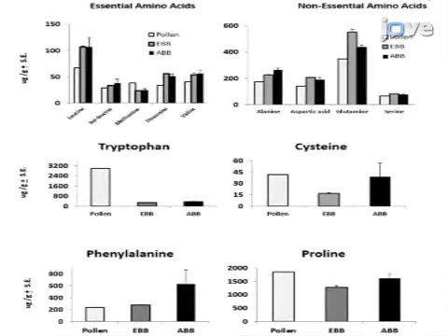The results show that bee bread differs from pollen in protein and some amino acid concentrations, as well as hemolymph protein titers. This method can help answer key questions in studies of honeybee nutrition, such as the role of pollen source on the nutrients in bee bread, and how those nutrients are acquired by bees of different subspecies, races, and genotypes.